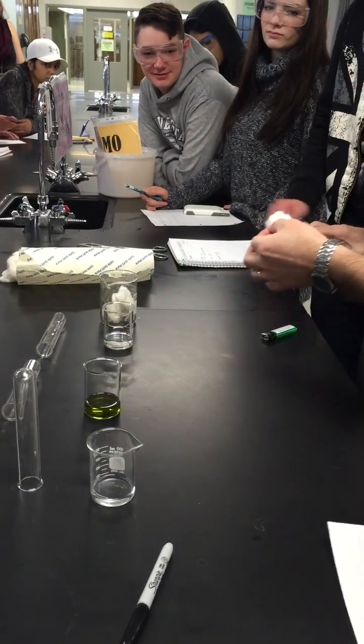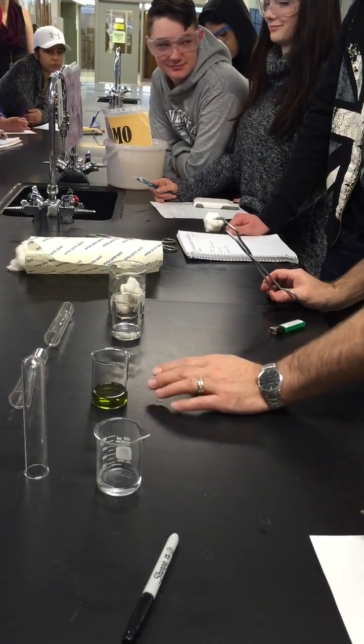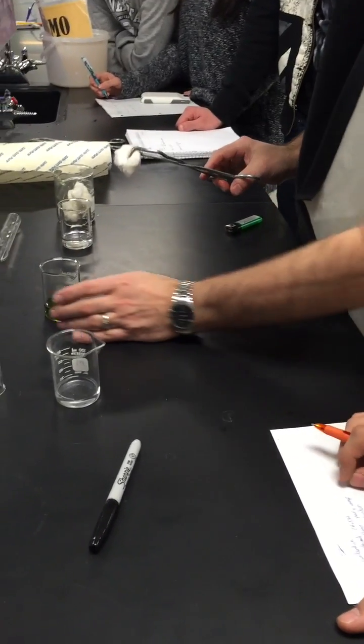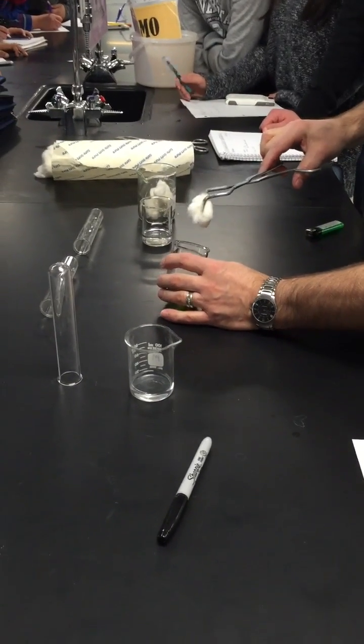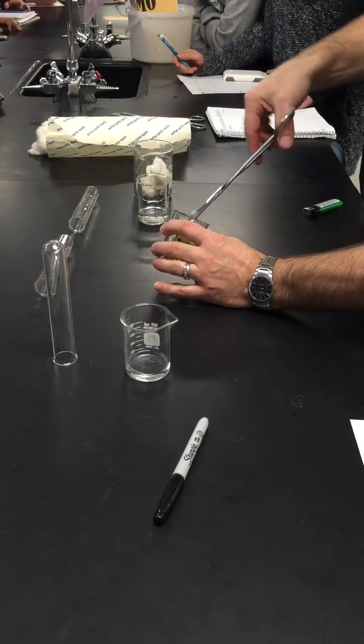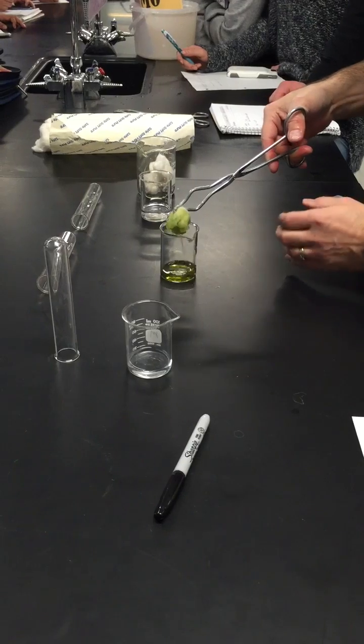This methanol was actually being used for another purpose and so that's why it's a little bit grungy looking. Methanol — sorry, ethanol. We don't have some extra on hand.